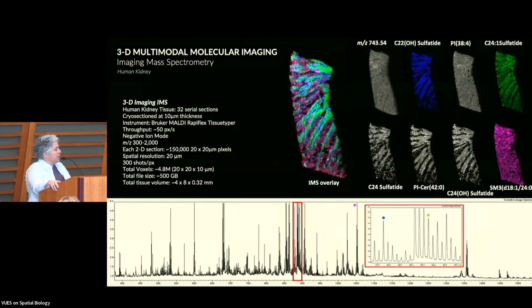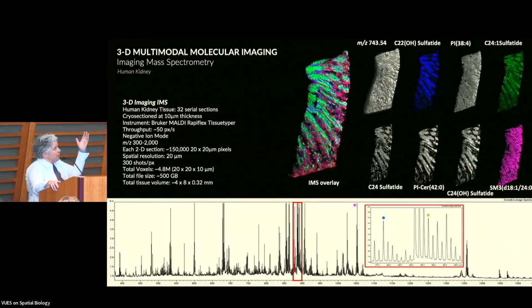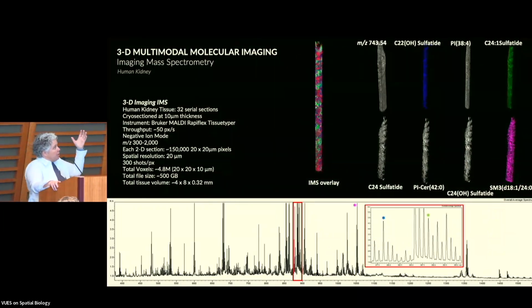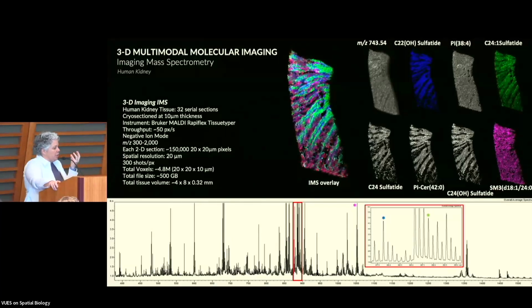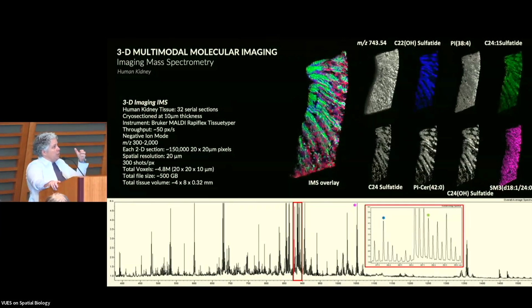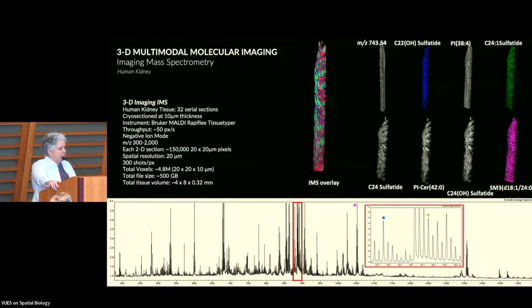And what we can then do is collect 3D IMS images, shown here. And this is really a brilliant, stunning example of looking at these lipids not just in that 2-dimensional plane, but in 3-dimensional space, and going back and answering some of those questions about why this lipid is associated with this region, or why this lipid is associated with this cell type.